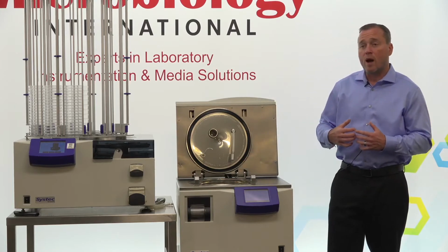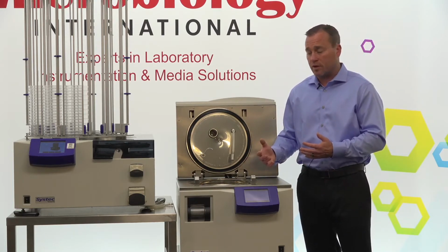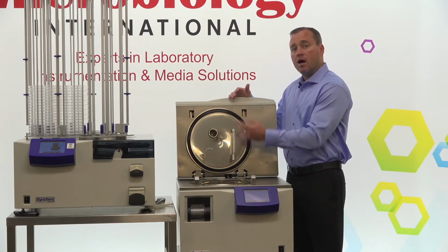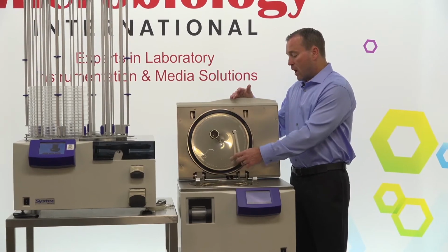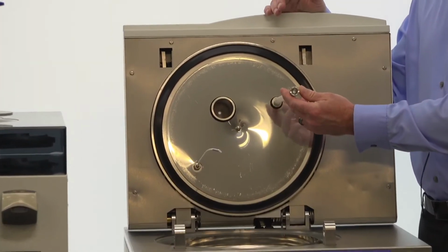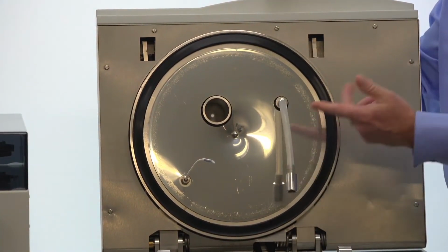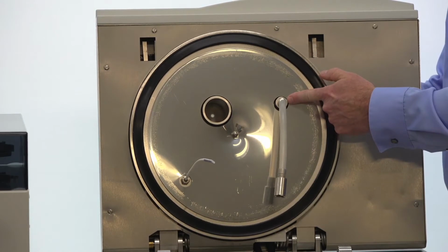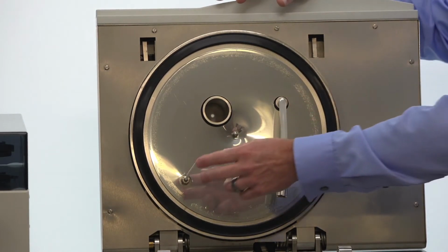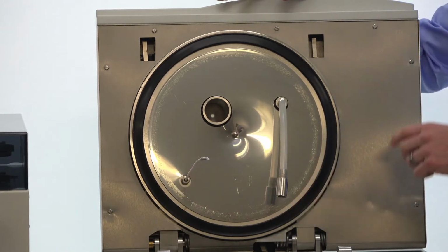What's actually going to drive that all into suspension, though, is the heat and the pressure that we're going to add to the unit. So on the top of the vessel, what you will see here, could you zoom in for me, please? What you will see is the port where we would remove the media from this. This sets down at the bottom of the vessel. So at the end, we would be able to create suction with a peristaltic pump and dispense into the individual plates. There is also a PT100 located on the vessel lid as well.